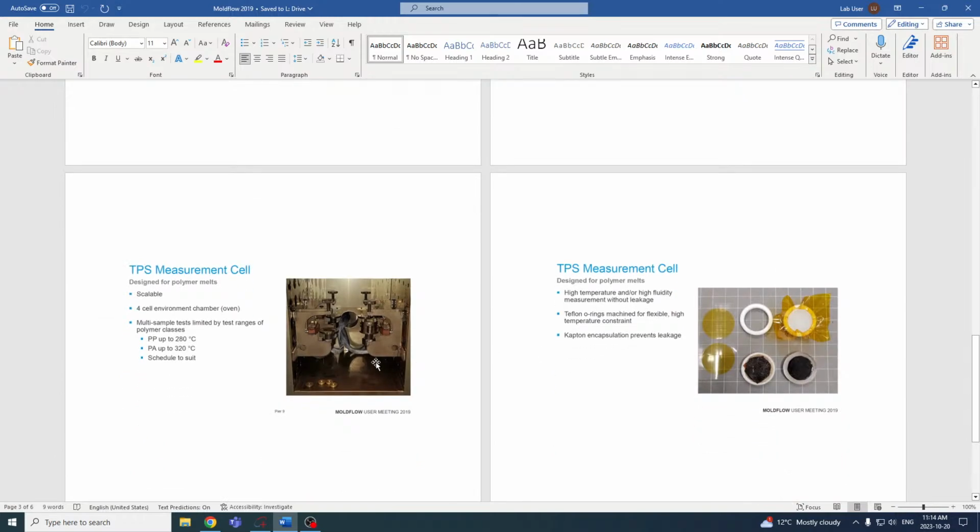The other configuration, other than the temperature platform, which is 1 sample per temperature platform, so you can have 2 different samples going at 2 different temperatures, is that you could put several samples in the same oven. The MP-1 comes with a 4-channel switch.